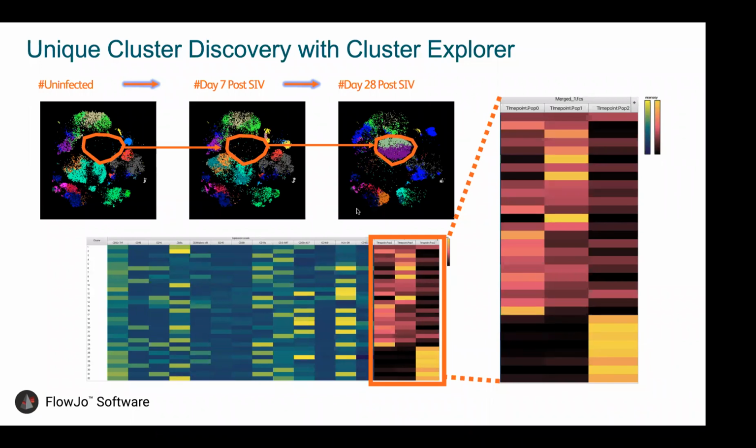Okay, so that was it for the high dimensional workflow here. So I will jump now into FlowJo, and we can discover how we can do it all in FlowJo. Unless there is an open question, I see Serena has already answered. Thank you, Serena. And we can go into FlowJo.